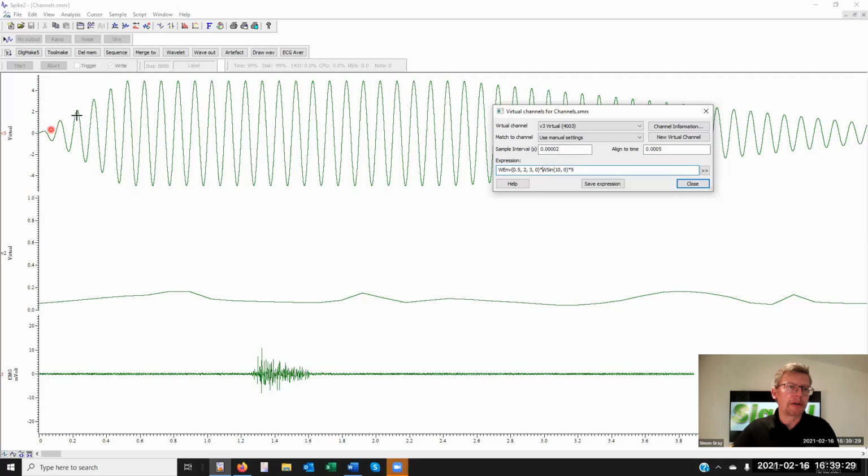Now we have the rise of half a second, hold for 2 seconds, and the fall for 3. So the envelope that I've produced, multiplied by the sine there, has given us a changing amplitude sine. So some people would call it a pip, some people call it a chirp type of output.